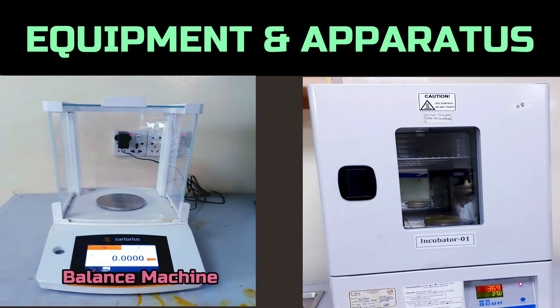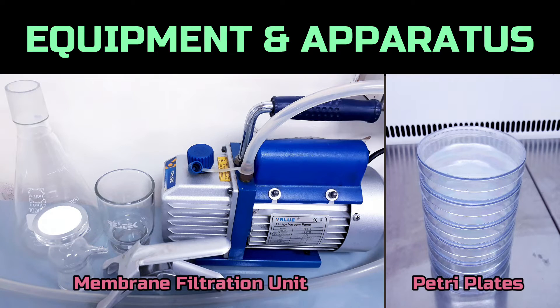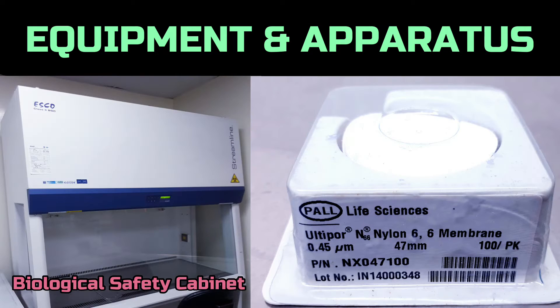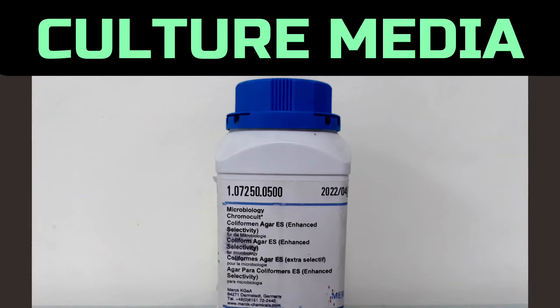Throughout the method, we need a balance machine, incubator, membrane filtration unit, sterile petri plates, biosafety cabinet, membrane filter, measuring cylinder, forceps, microwave oven, and chromocult coliform agar.